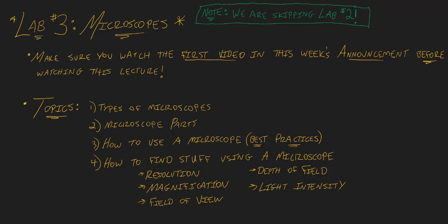And it goes through various technical terms you need to understand in order to fully grasp how microscopes do their job. She talks you through things like resolution, magnification, field of view, depth of field, and light intensity. Now, these are the topics that I think are the most important takeaways from this lab. So the rest of this lecture is going to focus here on topic number 4.